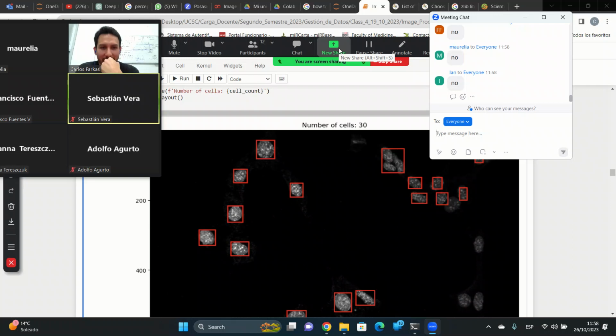Oh, no. Okay. Thank you, Sebastian, for the feedback. It's a common problem, usually in histology. In histology, when you have a tissue, for instance, the cells are not equally or evenly distributed on the slice. Plus, if the tissue is under development, for the people who are studying development, you will see enlarged cells, soma from one side to another, radial glia touching one edge of the tissue and the other part touching the other side, the classic definition of radial glia. You will see a lot of stuff going on. Small cells, rounded cells, clumped cells, in terms of blood imaging, Giemsa staining, for instance, or Plasmodium falciparum, or different stuff like that.